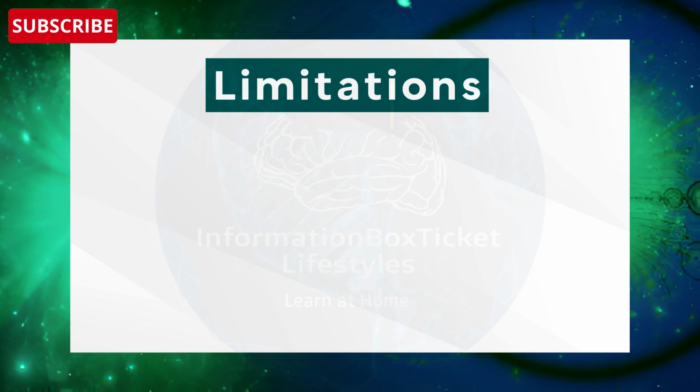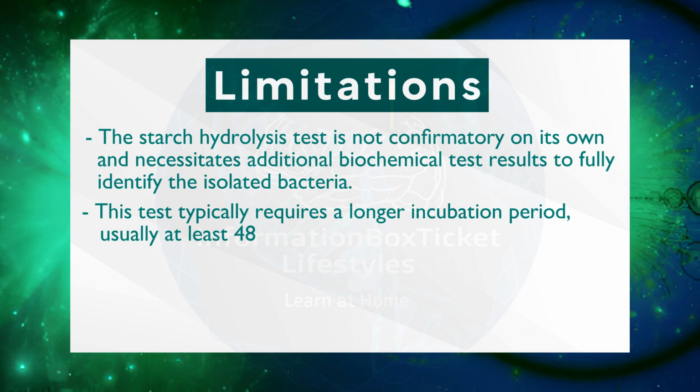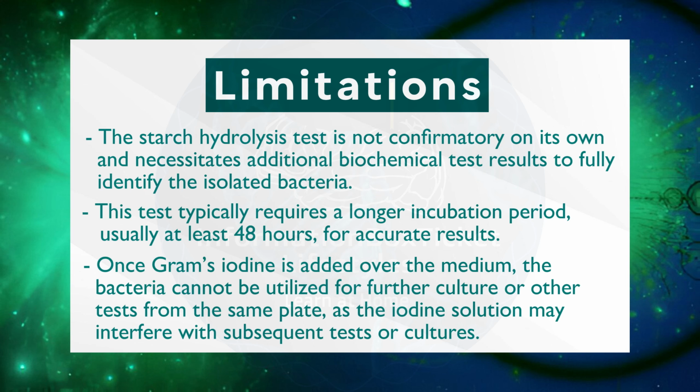Limitations of Starch Hydrolysis Test. The Starch Hydrolysis Test is not confirmatory on its own and necessitates additional biochemical test results to fully identify the isolated bacteria. This test typically requires a longer incubation period, usually at least 48 hours, for accurate results. Once Gram's iodine is added over the medium, the bacteria cannot be utilized for further culture or other tests from the same plate, as the iodine solution may interfere with subsequent tests or cultures.